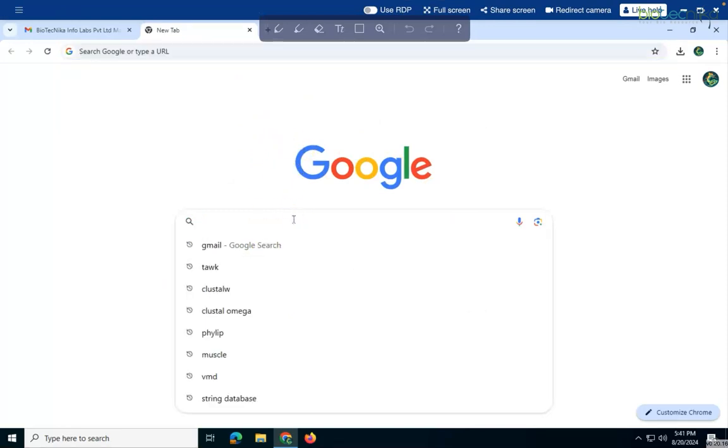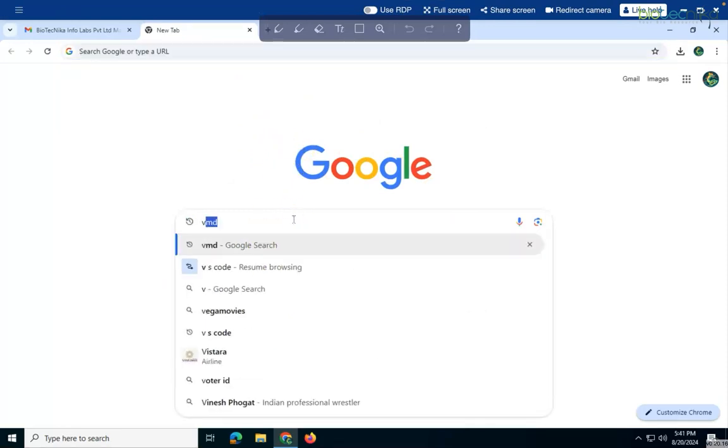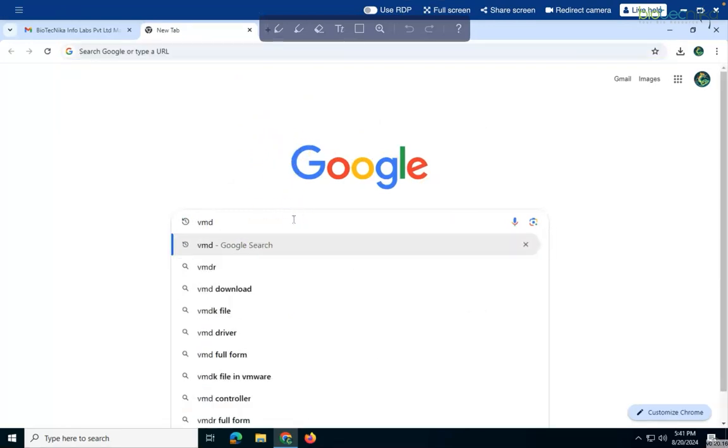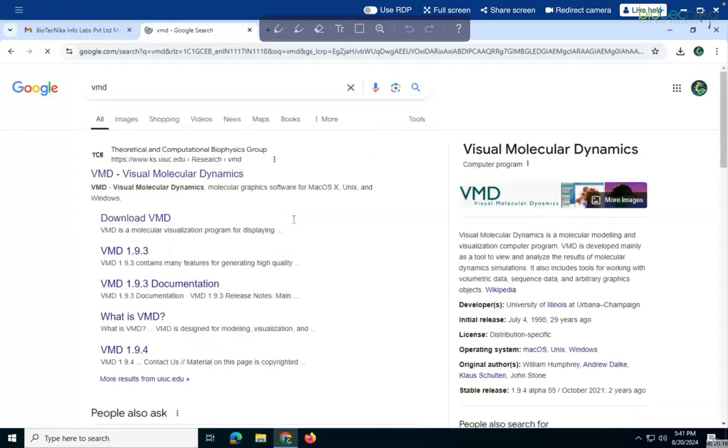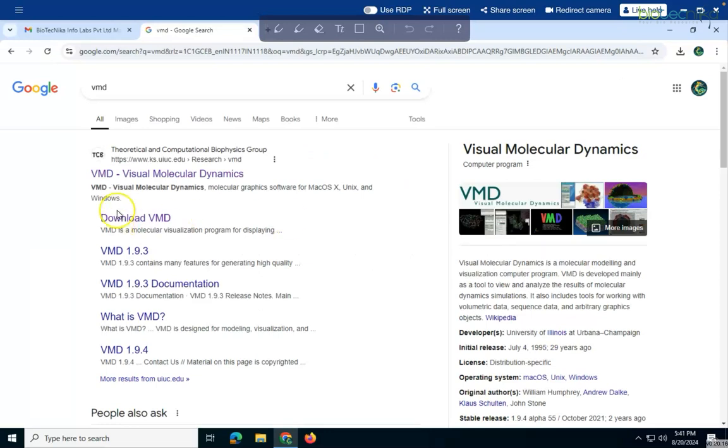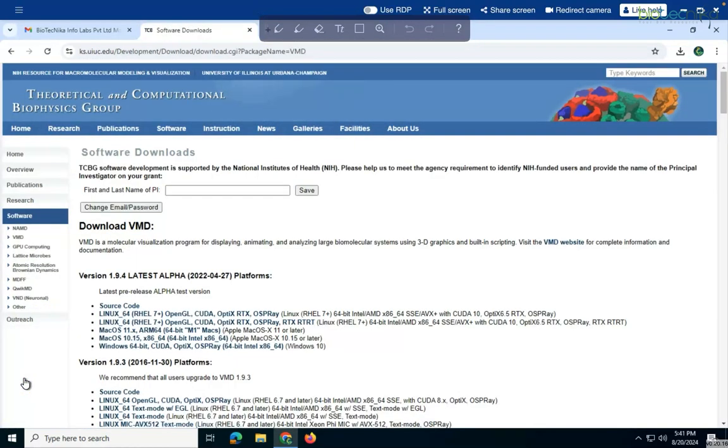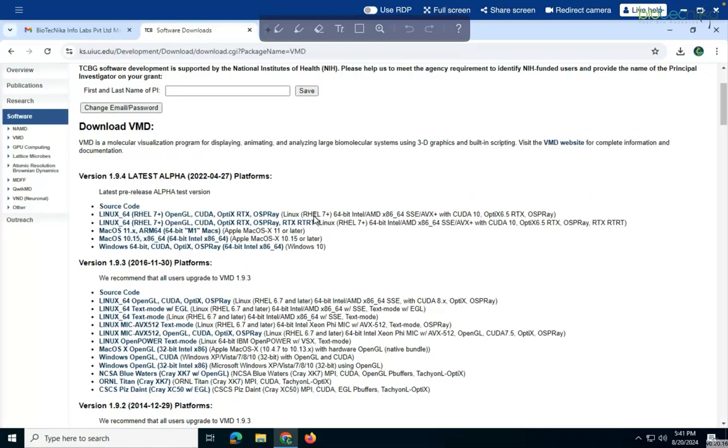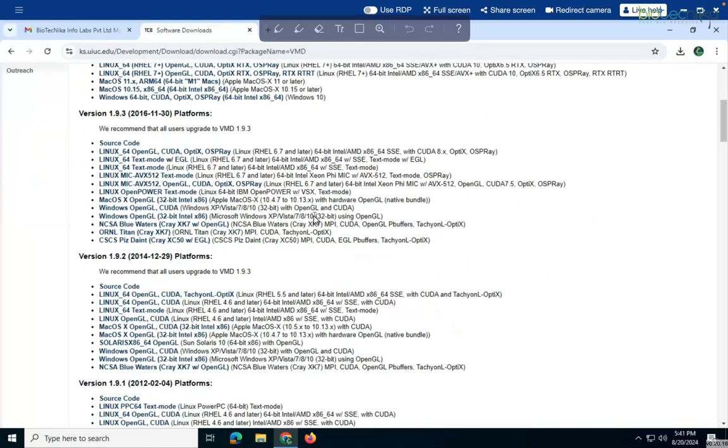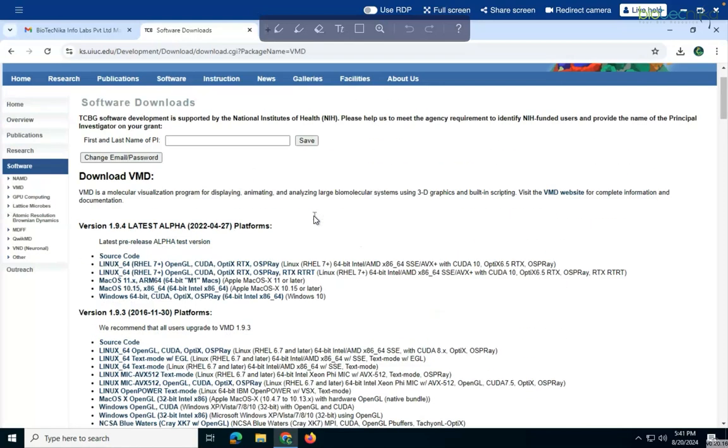So here we will type in VMD. If I search, see Visual Molecular Dynamics. If I go inside this, if I want to download I can go to download VMD. Once I go inside this, then I can choose my options like which particular interface I am having like Linux, Mac or Windows likewise.